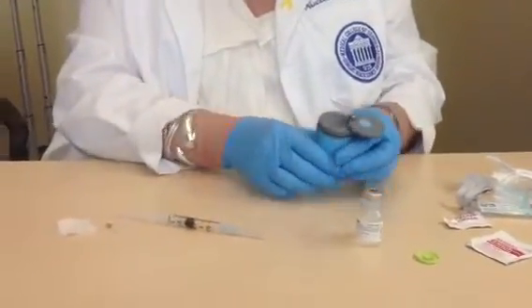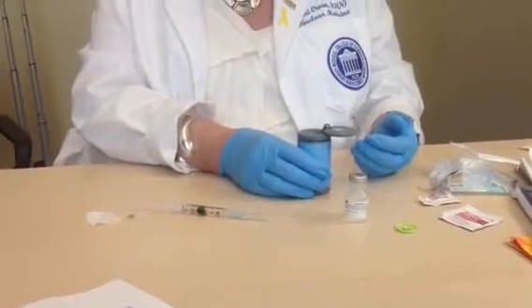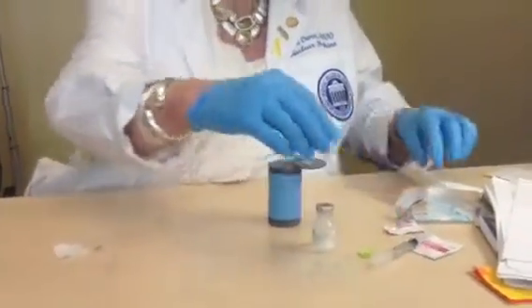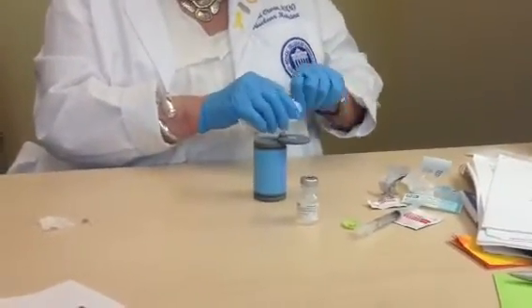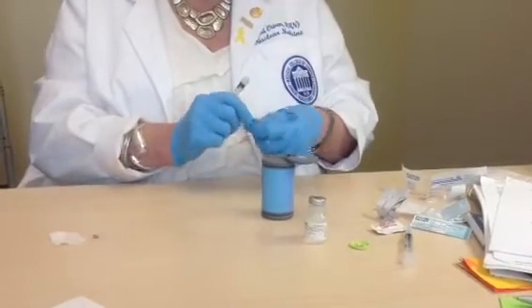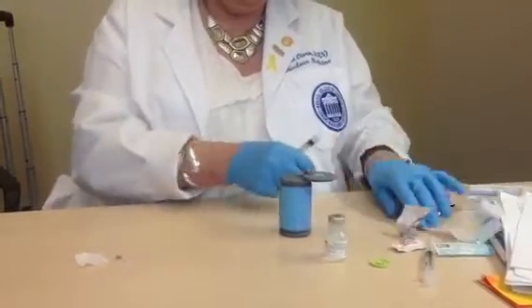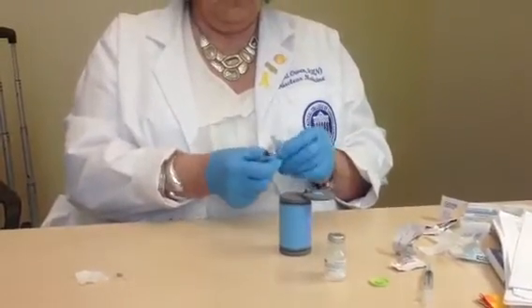Okay. Now, there are some things that are required, like you have to have the vial sit for a while, or it may be cooled down. But in any case, what I'm going to do now, not into the same bulk syringe that I reconstituted that in, but I'm actually going to then draw my dose up. Remember, I injected 10 millicuries into the vial, but I only need 5 millicuries for my dose. So I'm just going to withdraw 1 ml of my dose, and that'll give me 5 millicuries.